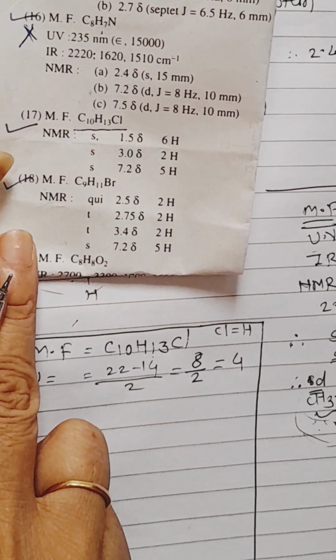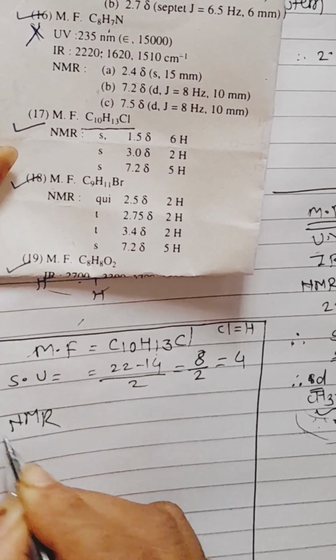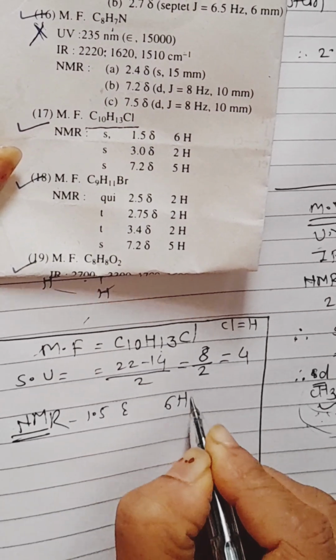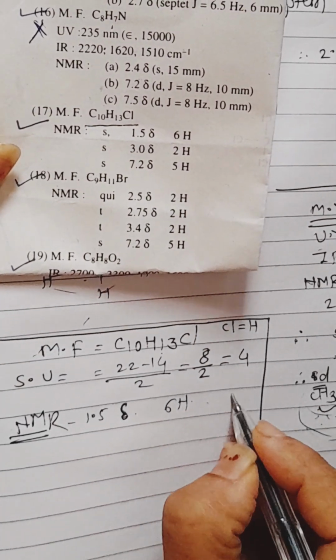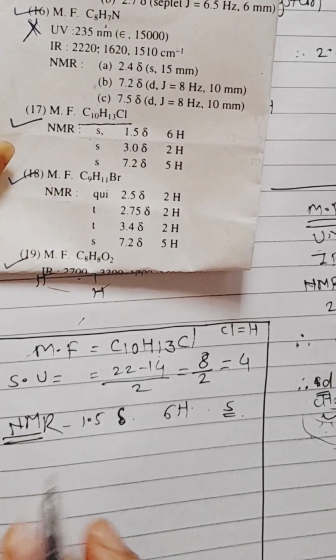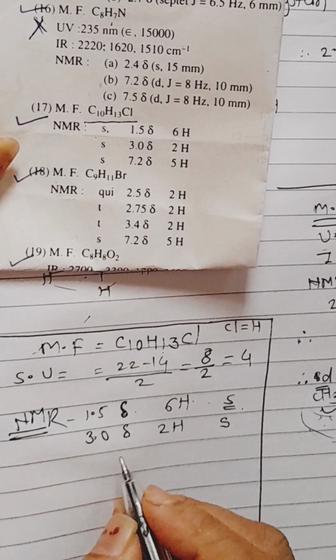The NMR data is given directly here. 1.5 delta, 6 hydrogen atoms, which show a singlet. 3 delta, 2 hydrogen atoms, singlet.